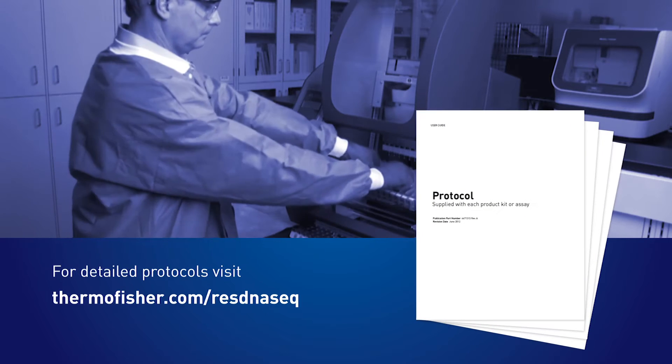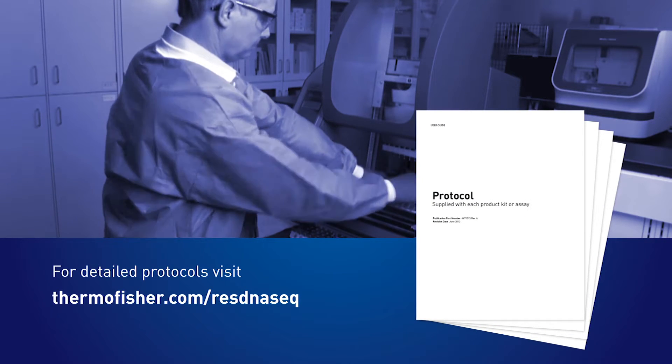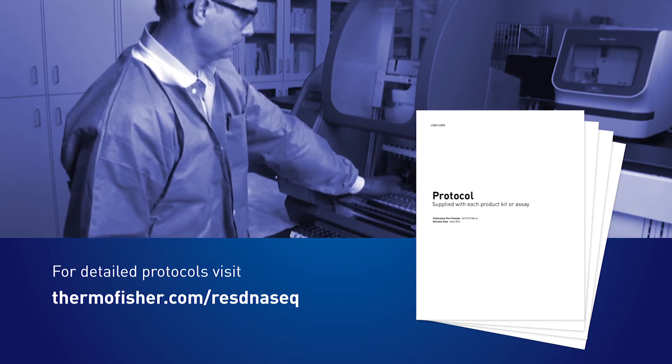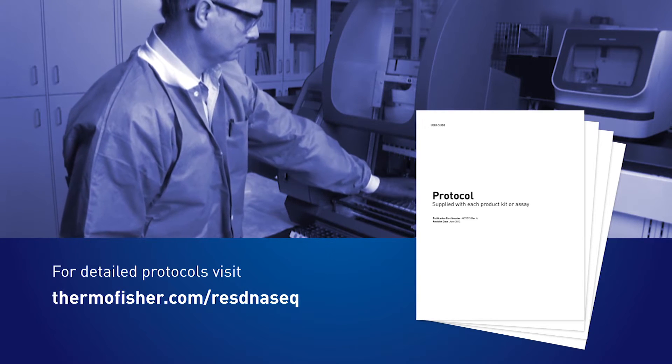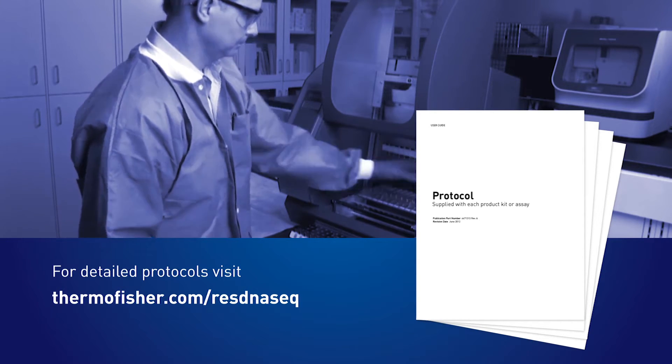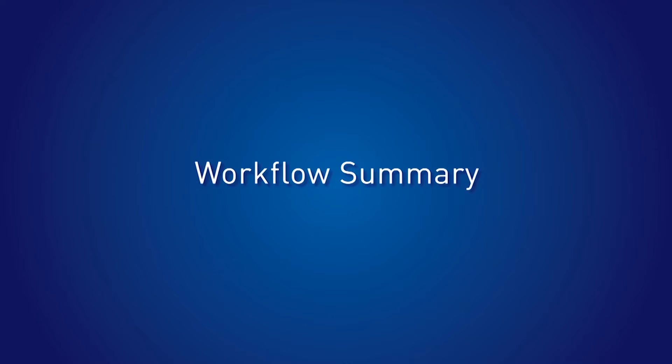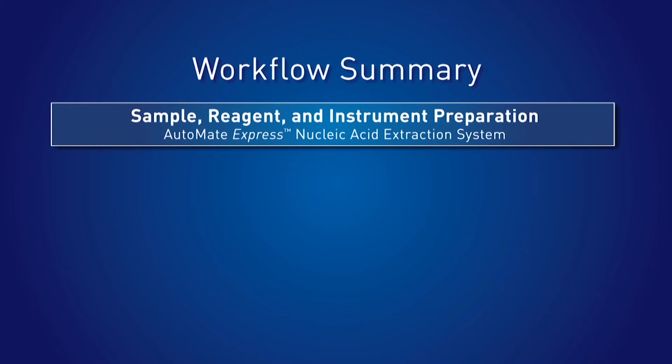This workflow video highlights and expands on your existing protocol. To get the most out of this tutorial, have your protocol at hand. The first step in this protocol is sample, reagent, and instrument preparation using the Automate Express nucleic acid extraction system.